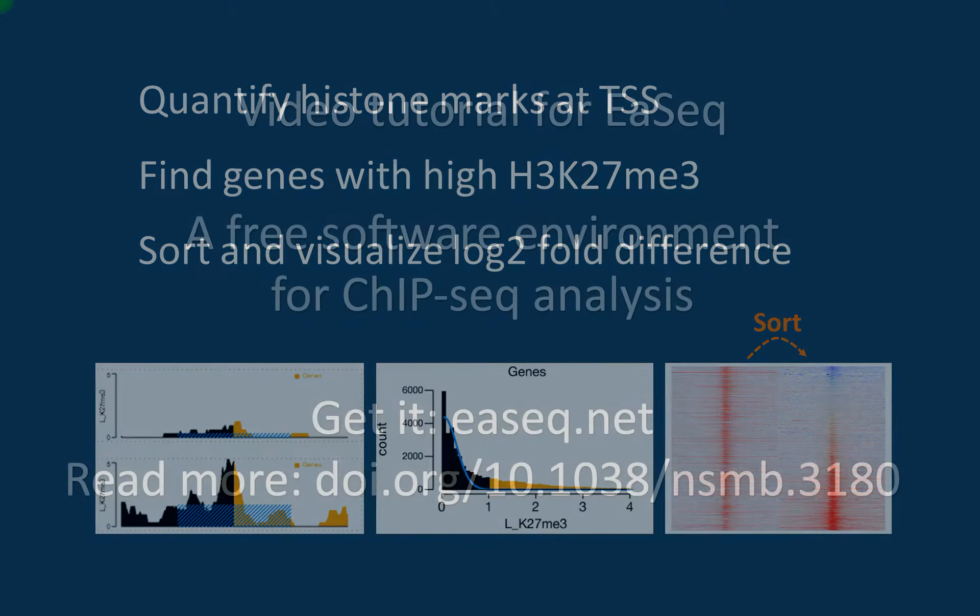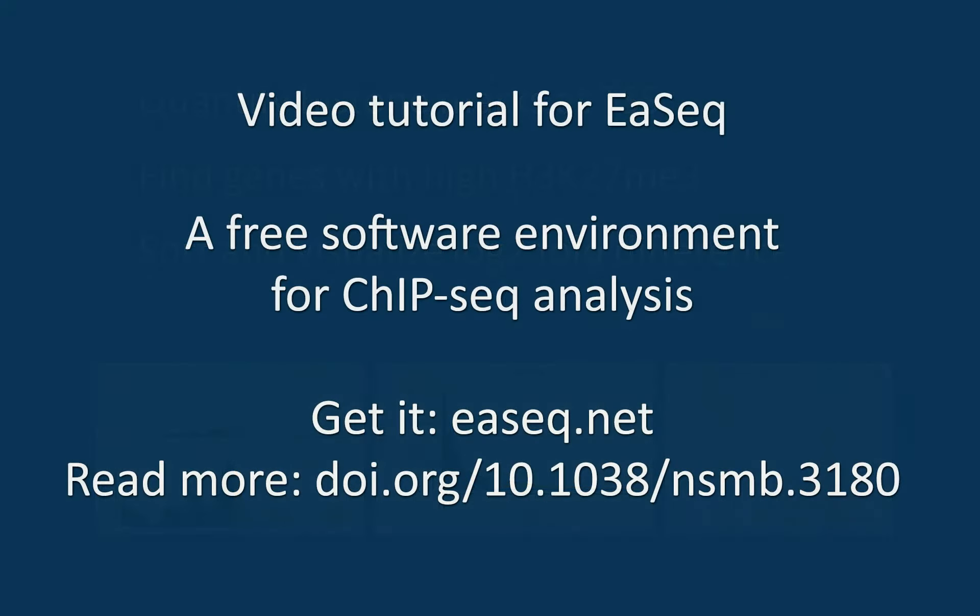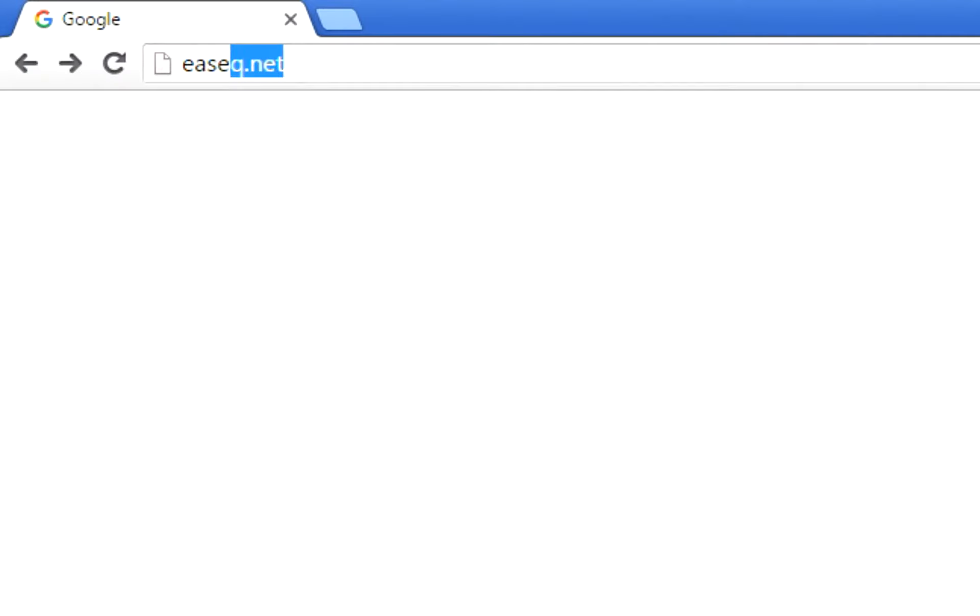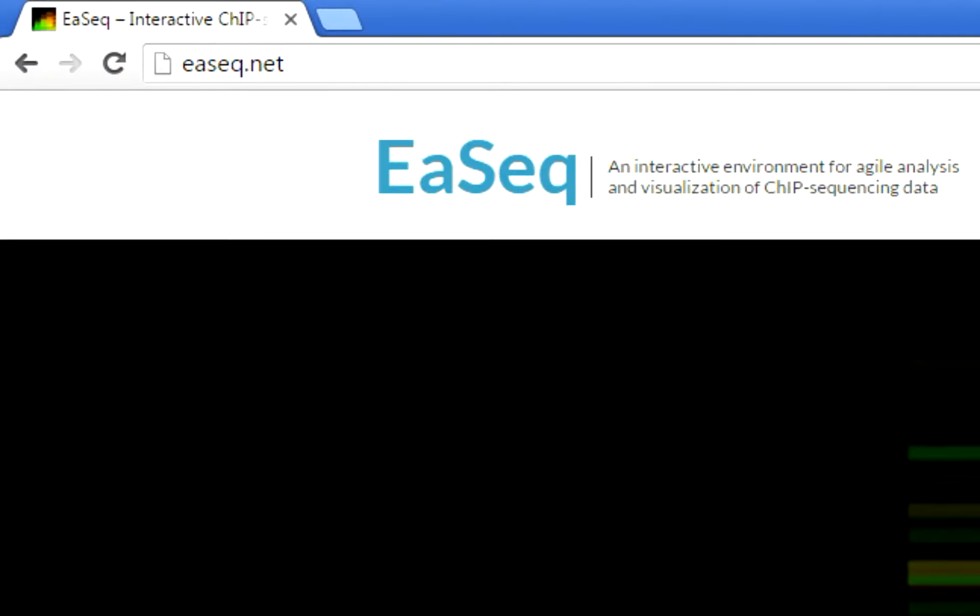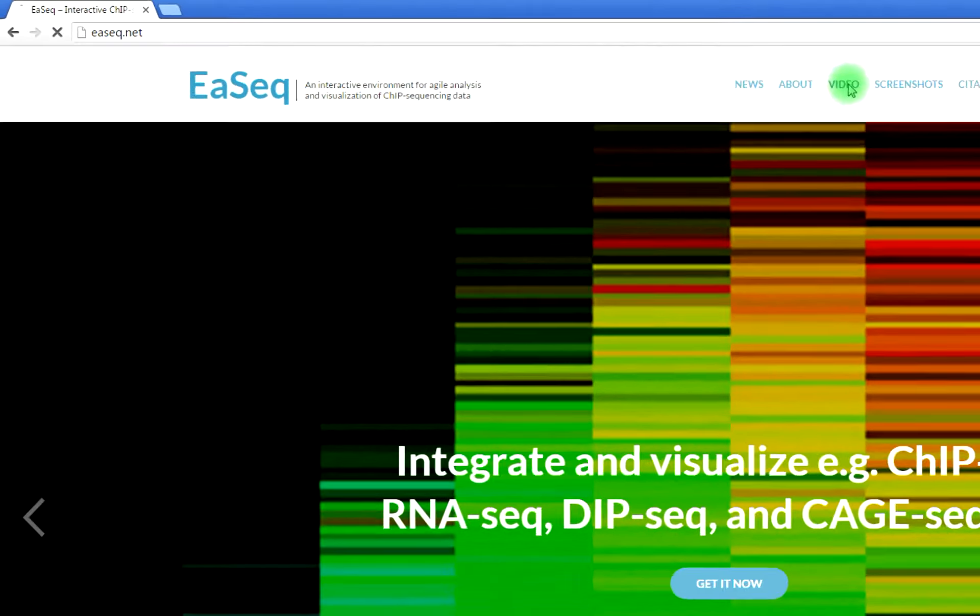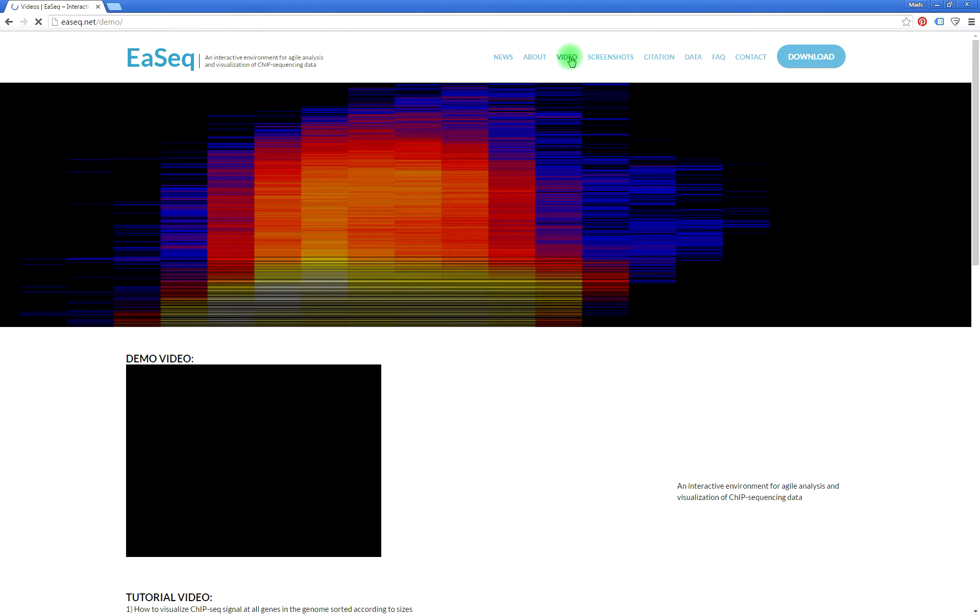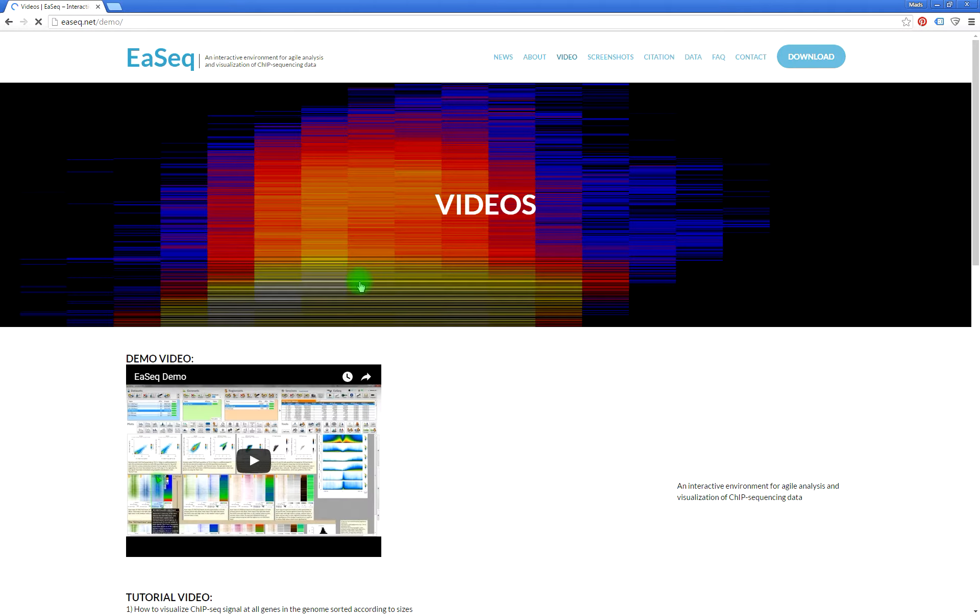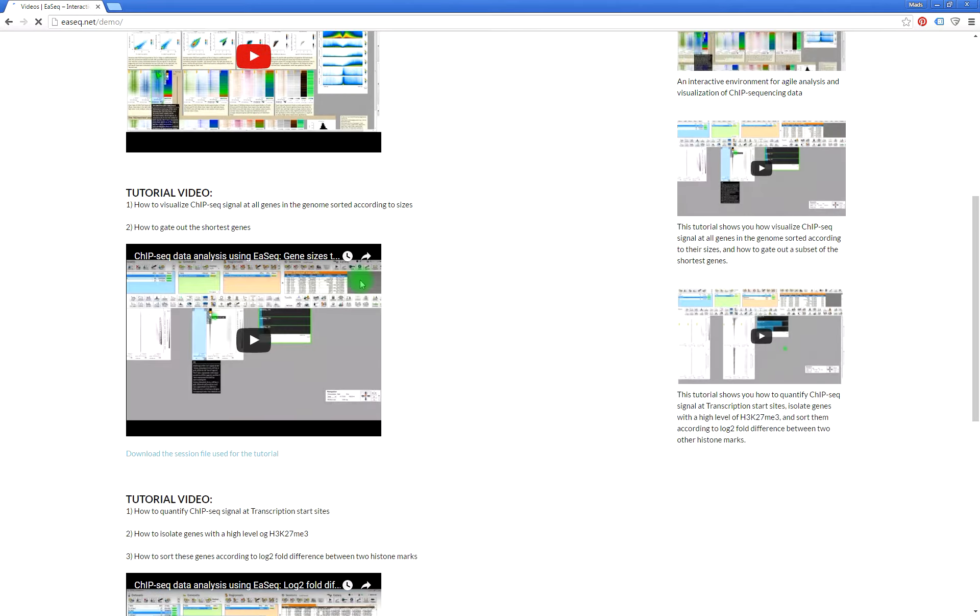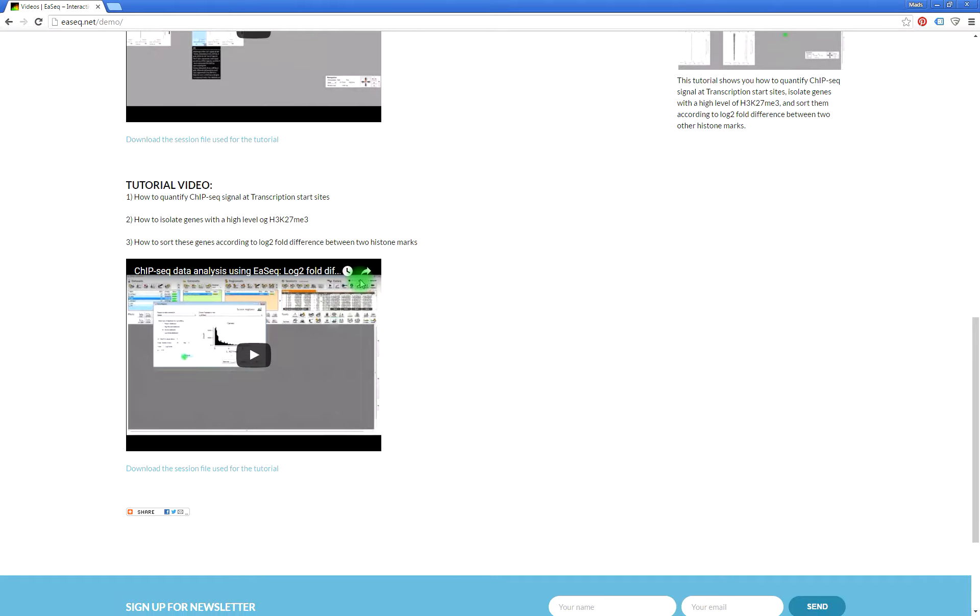So first you will need some data. The data for this tutorial can be found at easeq.net under videos. There is a session file associated to the link to this video.